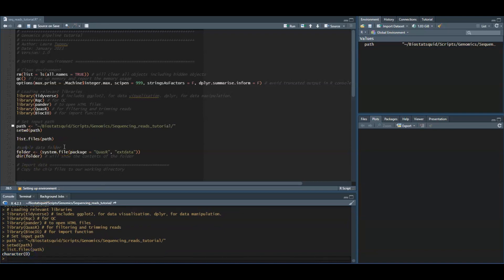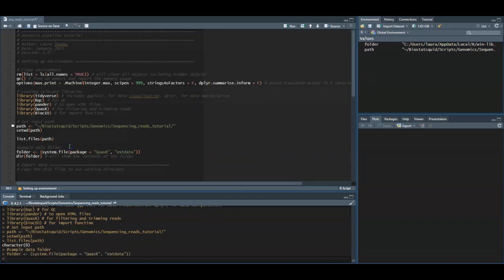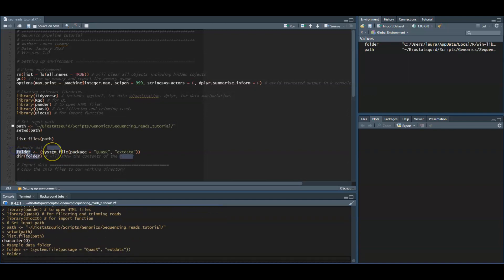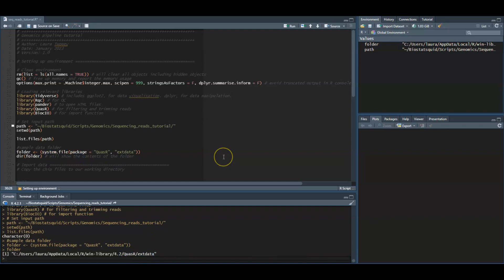I will be using sample data from the package QuasR and it's actually found in a subfolder called extdata. I will just set the folder location and we can print it here. With the directory function we can print out all the contents of the folder.